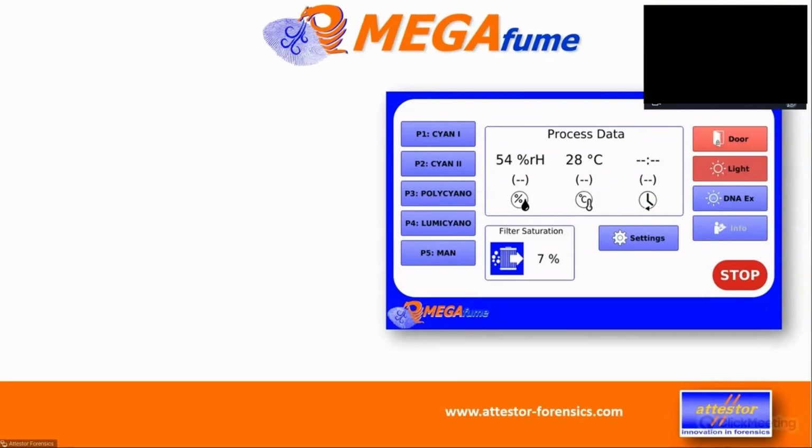0.3 grams for that size is probably a bit below what you should do. But in a university where you want to show some experiences, where you say, okay, what happens if you have too little glue in there and so on, it could happen that you work with that. Typically, for that cabinet we were talking about, which is a bit bigger than that one, I would say somewhere between 0.5 and 0.8 grams is a good amount.